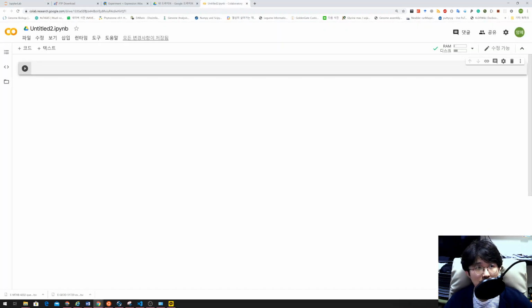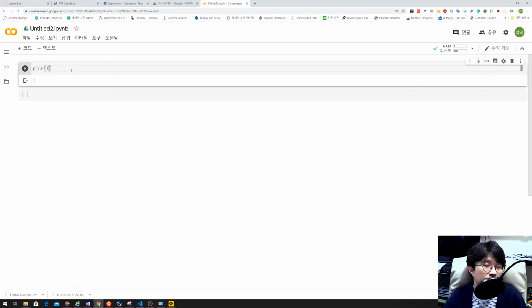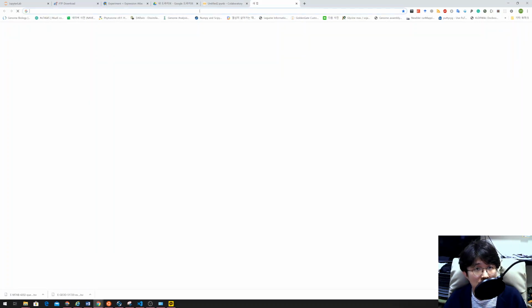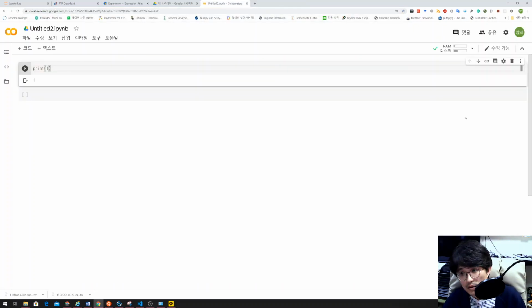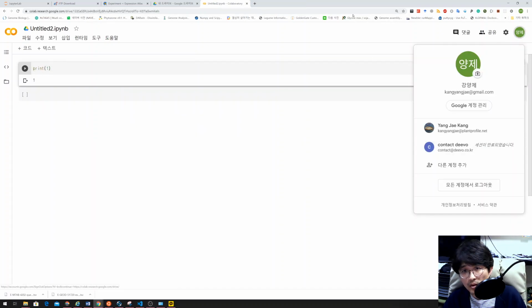So if you are interested in this analysis, then try the analysis here. This platform gives you a Python environment, so you can use any Python command here. Everything can be copy pasted here to regenerate the result. But the only problem is uploading the data. If you are interested in uploading, I will show you.